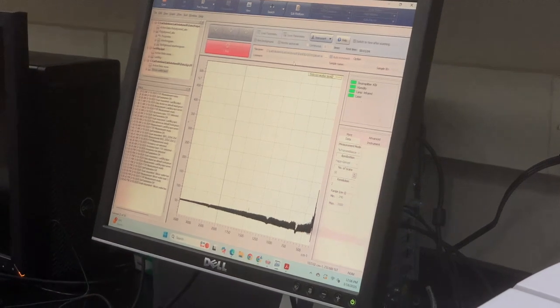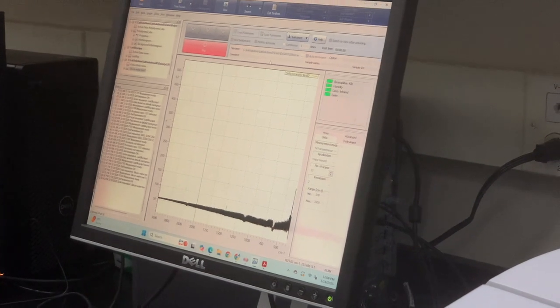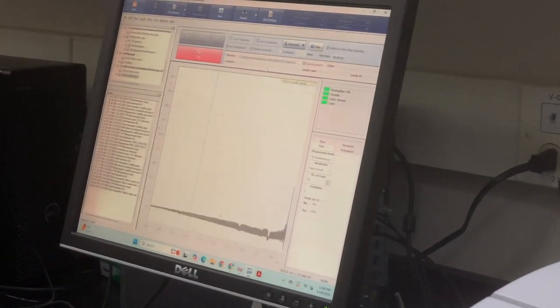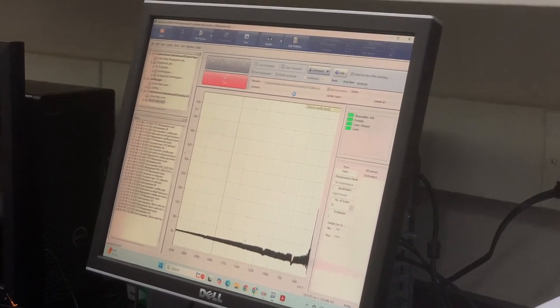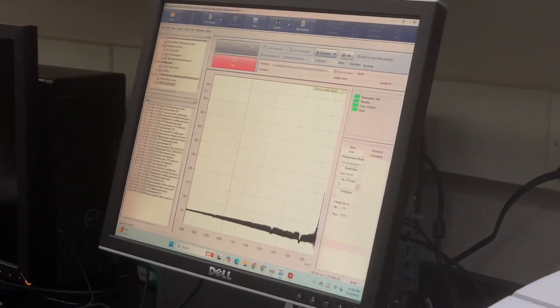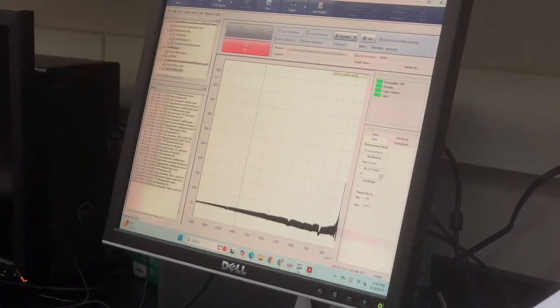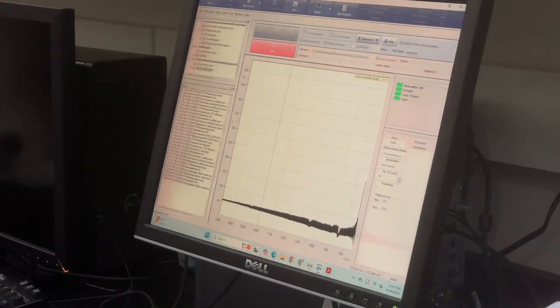So what samples do people normally test for, if they have the equipment at a university or something? Oh yeah, we ran down the list. Everything. People do thin films. People do powders. In chemistry 101, they like doing the ATR and doing liquids, like organic volatiles. I've seen windows, kitchen cabinets. I've seen so much, honestly. We have an accessory where you can just drop a full capsule in, so I've seen people just put full capsules in.